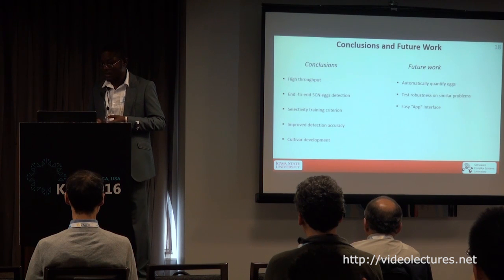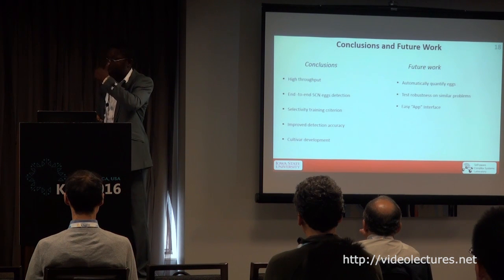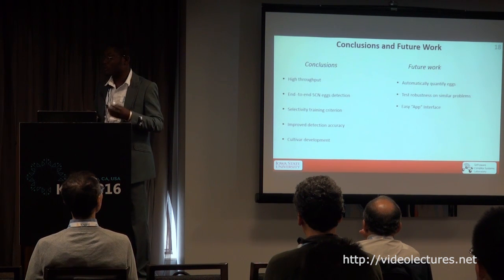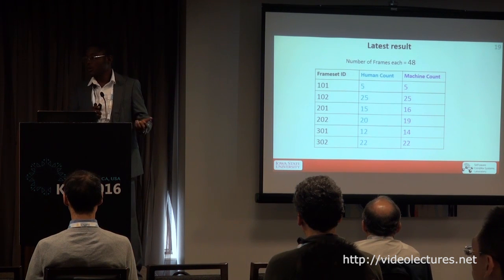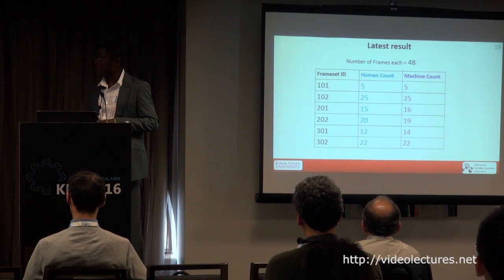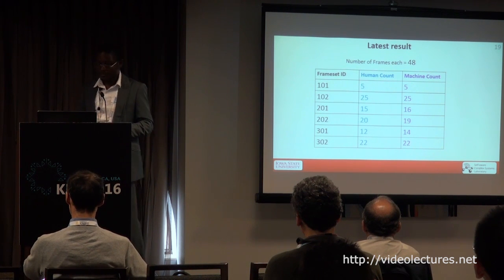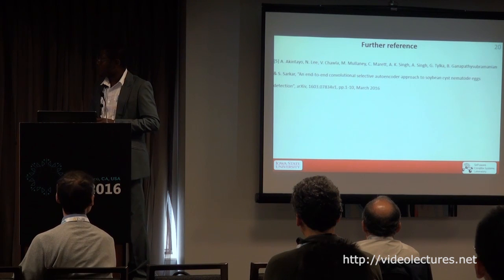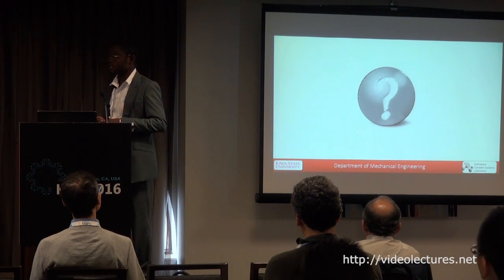We've actually quantified it, and the next thing is to try to test the robustness of our algorithm on other rare egg detection kinds of problems. And using last year's model, we're given a new set of data to also quantify on. And here are some of the statistics we have lately, which we are still improving on, for your consumption. Thank you for listening, and any questions are entertained.